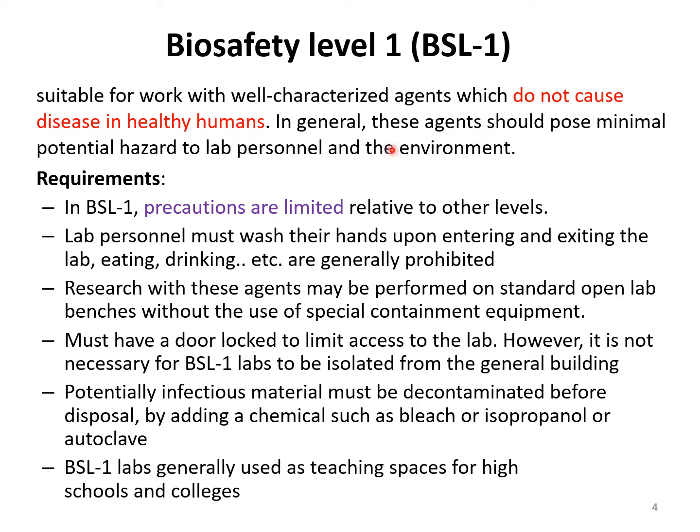The workers in BSL1 labs deal with pathogens that are not infectious in general. Although they might cause a minimal potential hazard, they are not well-known infectious agents.